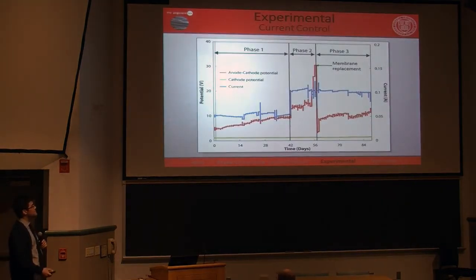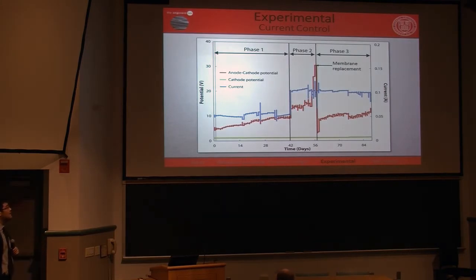And just a little bit about some of the experiments that we've done on the system. We just wanted to try seeing if there's any bit of a higher flux in the reactor. So running in a galvanostatic mode, we doubled the current to see what would happen to the reactor, and you'll see extraction data in a minute.